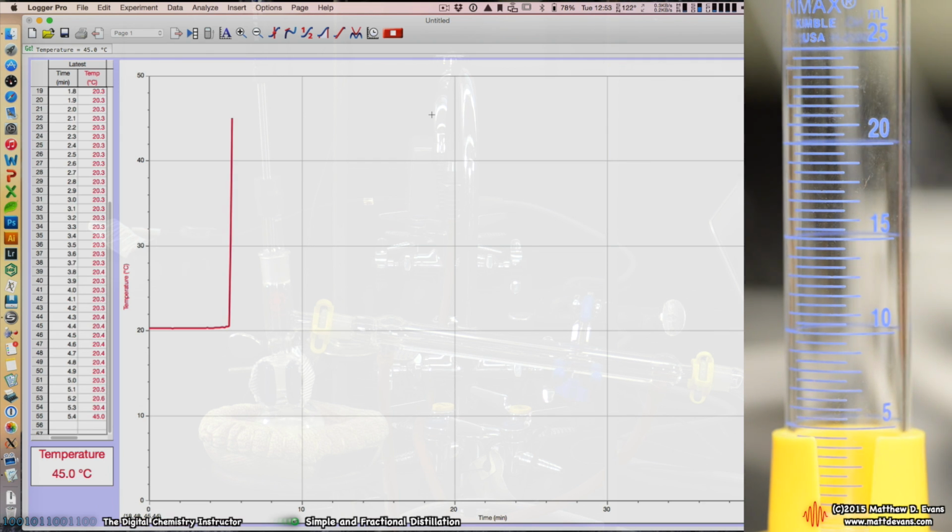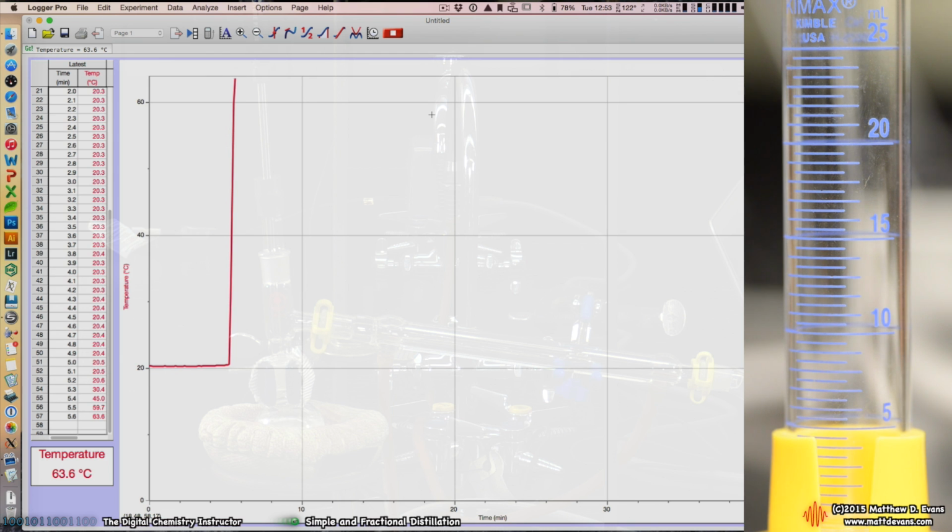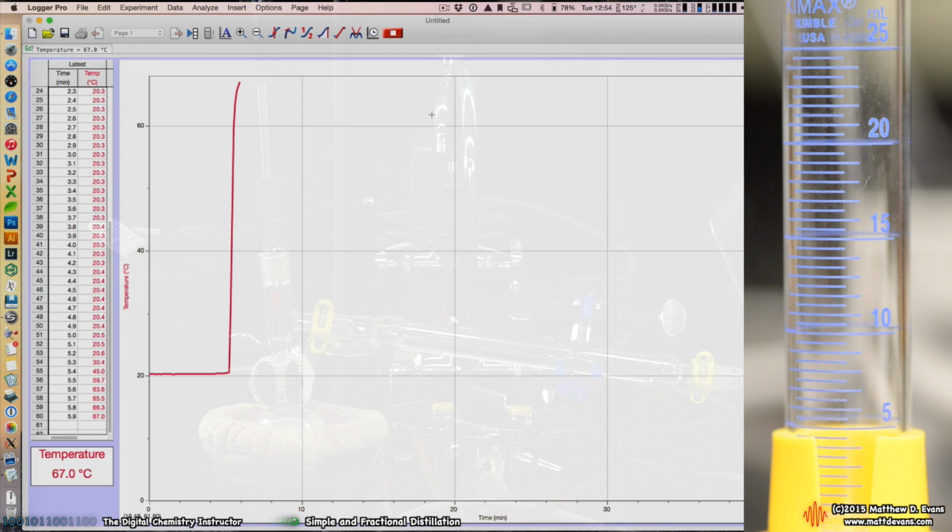Now I'm looking at the temperature, and it's very quickly rising, which means that we're pretty close to dripping already. And so now I'm gonna scale this back even more. And we're watching for the first drop and making sure that it's about a drop every 2 seconds. Here comes our first drop. I can just see it forming at the end of the dripper tip, or the end of the condenser, I should say. There it is, the first drop.